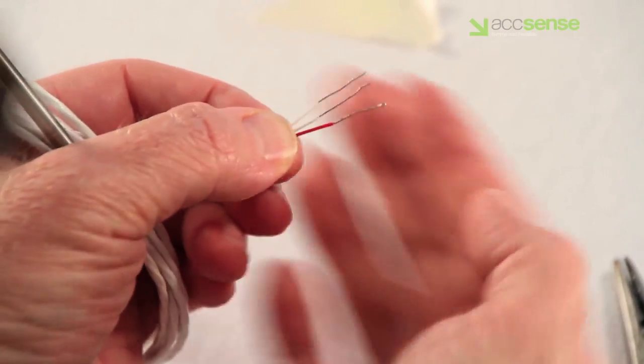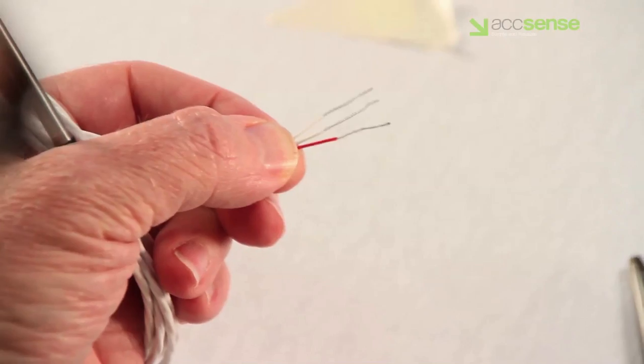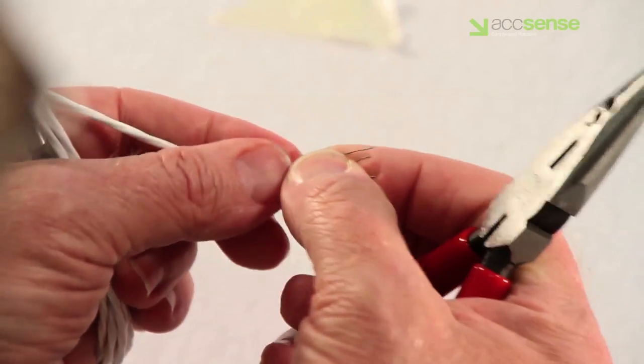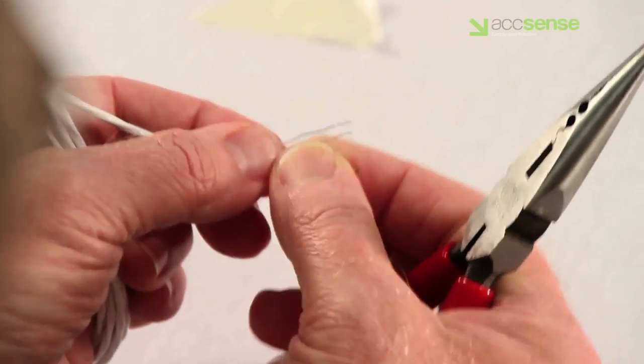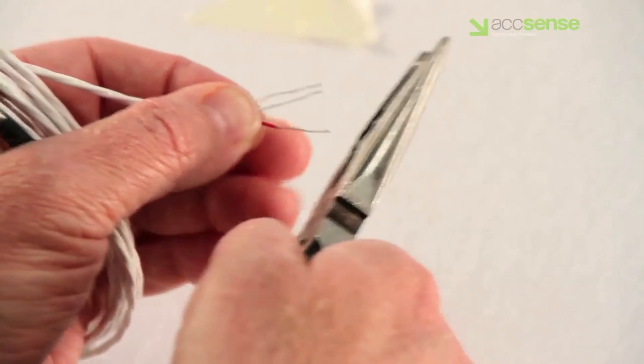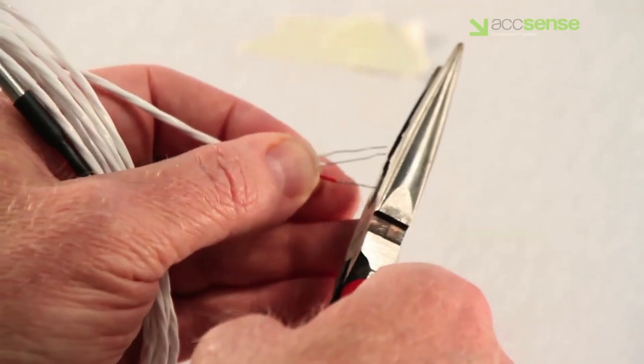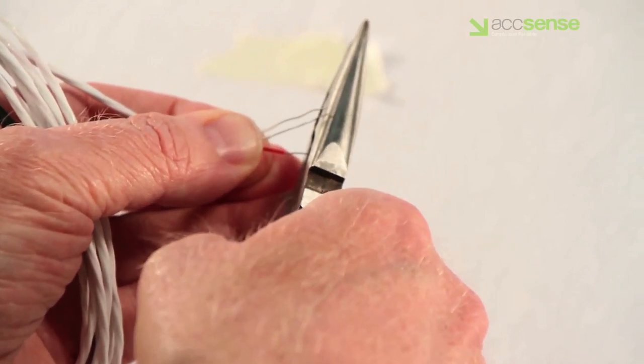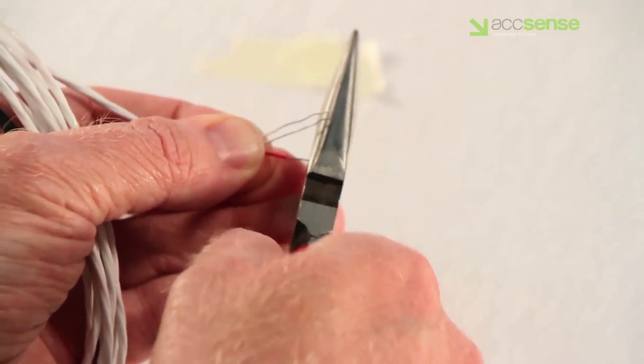Before installing the probes, check the stripped length and shorten the length of exposed wires to a quarter inch if necessary in order to prevent any shorting of the wires at the terminal block.